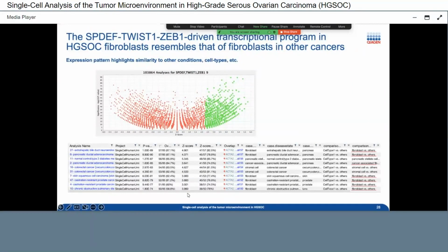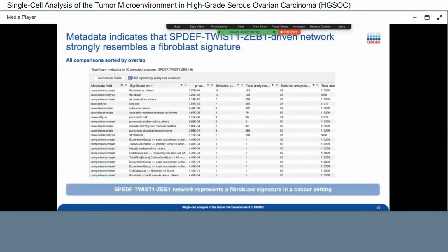And I didn't do anything here. I didn't filter. So when you click on these guys, you have that window that happened here, and it mainly shows this is in single cells without any filtering. And you look at the type of comparison, it's always cell type versus others, and mainly fibroblast. But that's my view here. But I can look and ask a question about stats and looking at evaluation of the metadata per se, so having an unbiased way. Well, that's what I've done here.